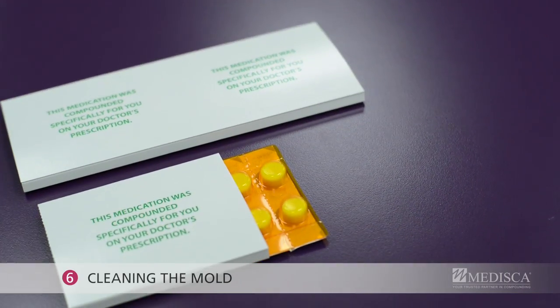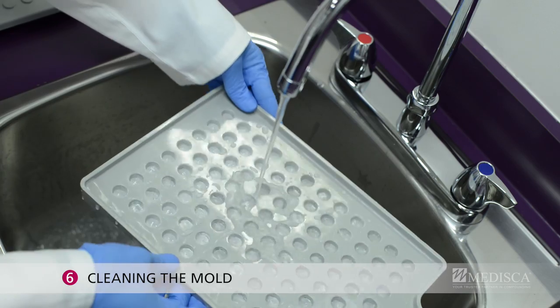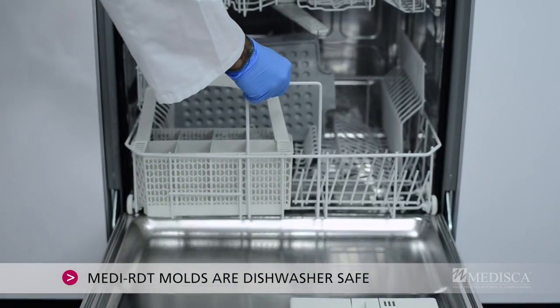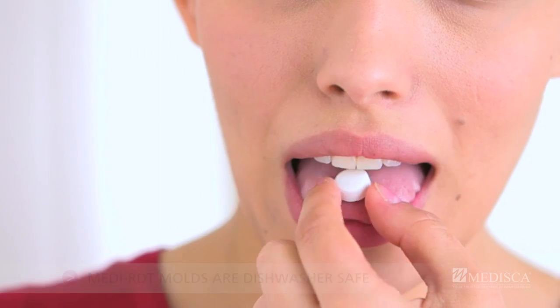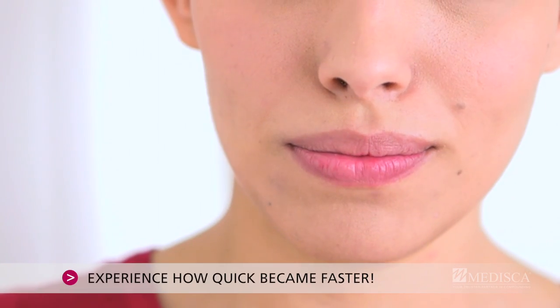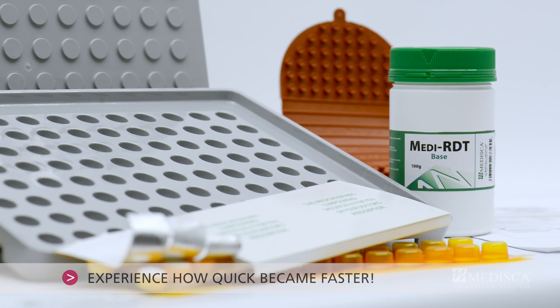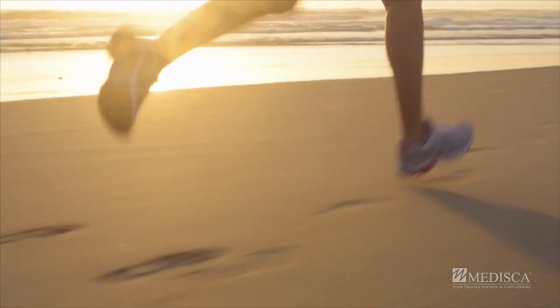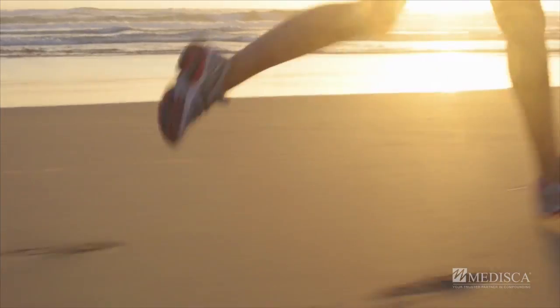Step 6: Cleaning the molds. Rinse the molds and place them in the dishwasher. This is how your RDT preparation time becomes quicker so your patients receive their dosage faster. Medisca's comprehensive RDT kit will help you grow your practice and competitive edge, and with our RDT in hand, your patients can quickly get on with their lives.